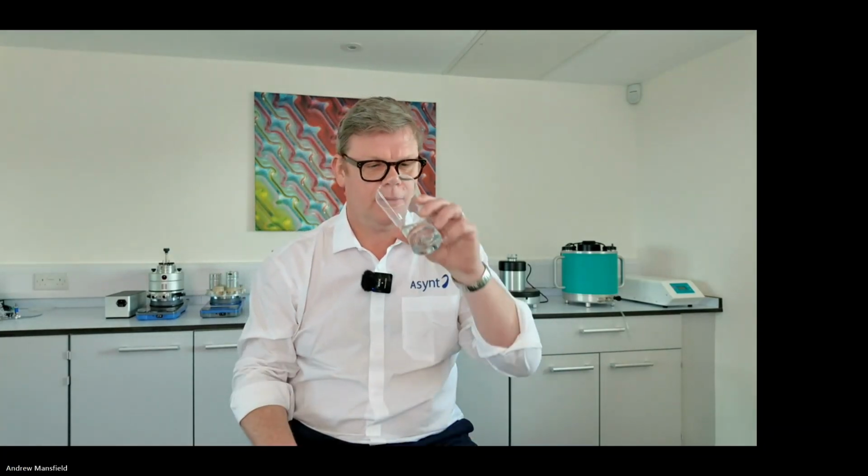And so can you control it by also playing with the temperature, or is that usually not the case? Temperature, intensity, solvent selection, concentration, just trying to adapt your chemistry so that the degraded material is more readily dissolved, and the flow system is able to continue. Cool. Thanks a lot.